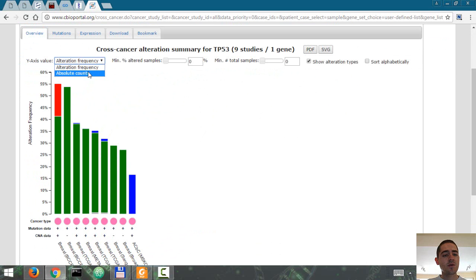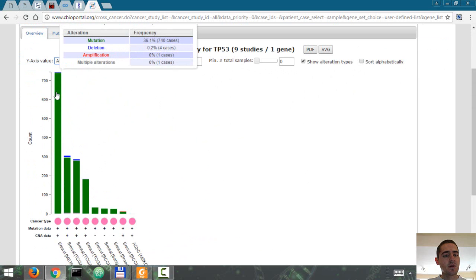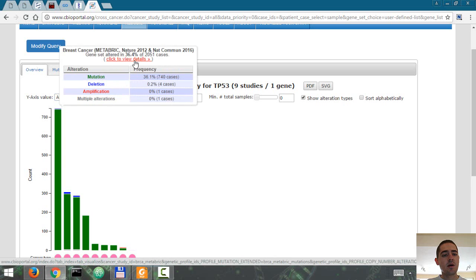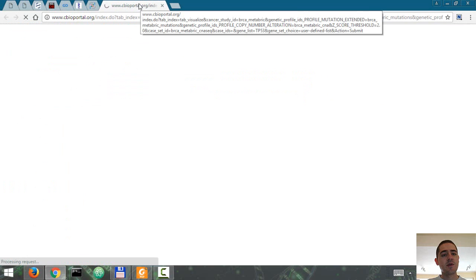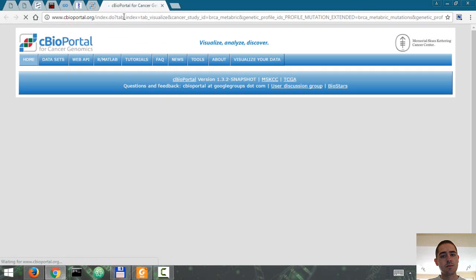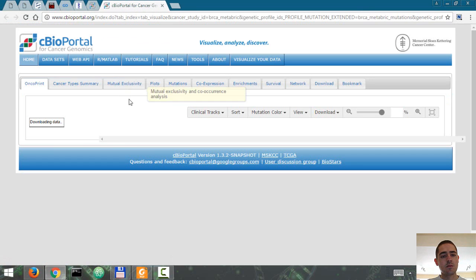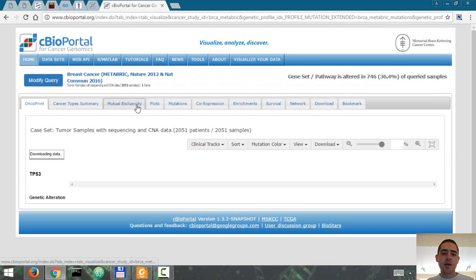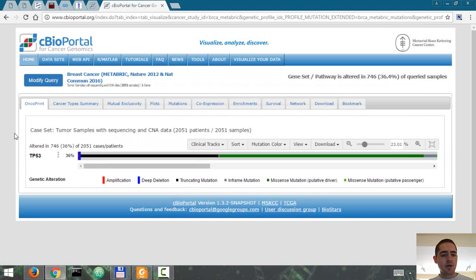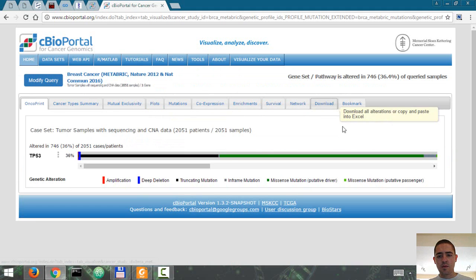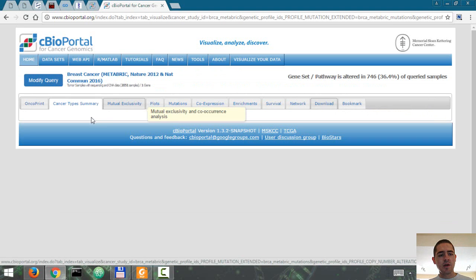We can also select to see the absolute counts. This is for the Metabricks study and the paper. Let's click here and see the summary of the available data. So 36% frequency of mutation. Here's a summary.